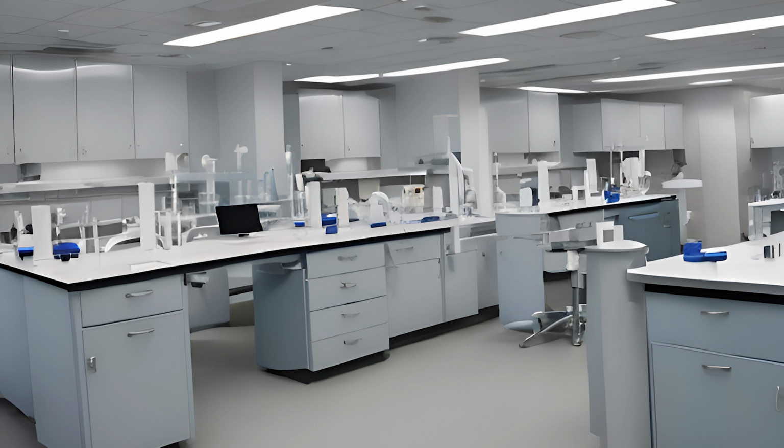Regardless of an exposure route, your exposure plan will require that all exposures have immediate attention. Whether it's in the eye, the ear, the mouth, the nose, it's a needle stick, they all have to be reported and documented immediately, starting with a report to your immediate supervisor.